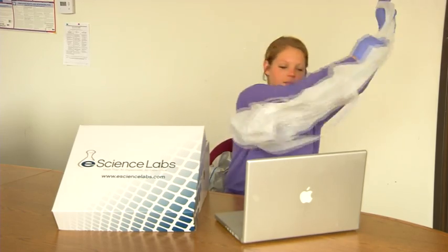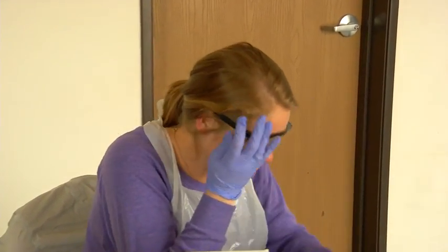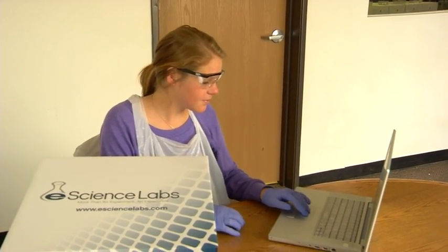Food and drink should not be present when completing a lab. Finally, wear the gloves, apron, and safety glasses provided in your kit. Read all the labels on every chemical. If you have any questions or concerns, read the material safety data sheet for the chemical you are working with.